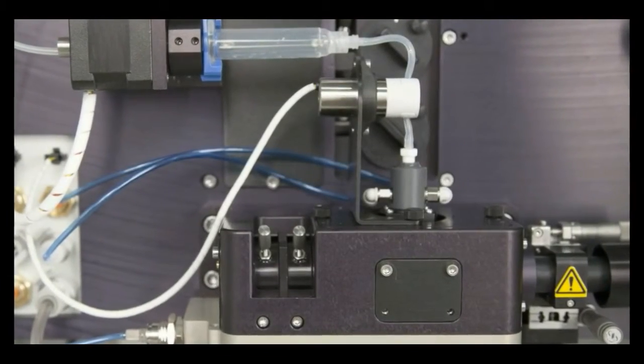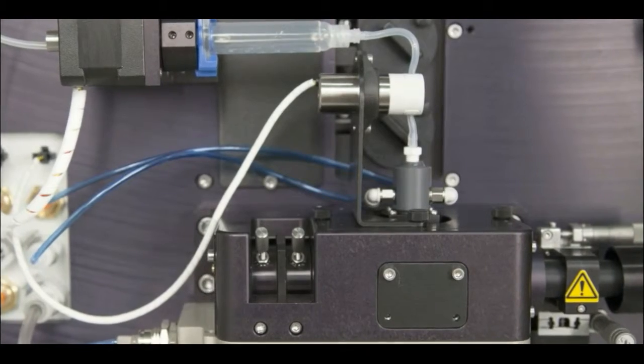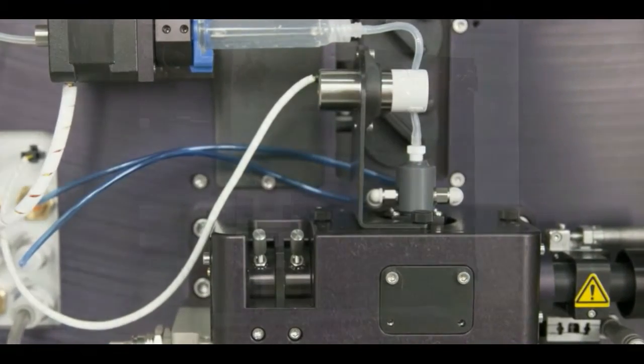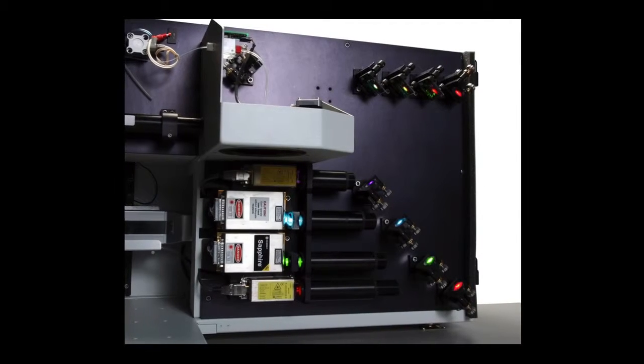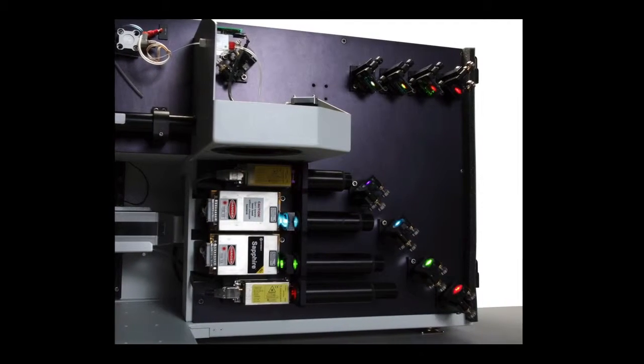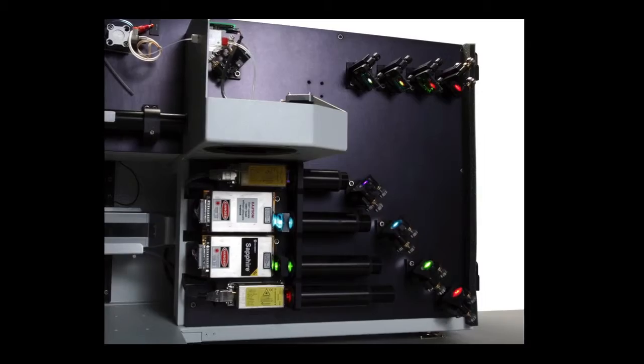Samples are introduced to the flow cell, where they are surrounded by a sheath solution. This hydrodynamically focuses each object at the center of a quartz flow cell, where it is interrogated by up to four lasers, and measurements of size, optical density, and fluorescence are collected for each object.